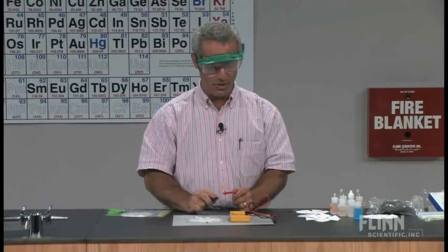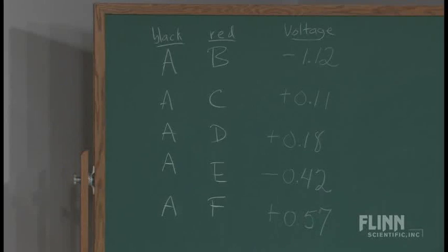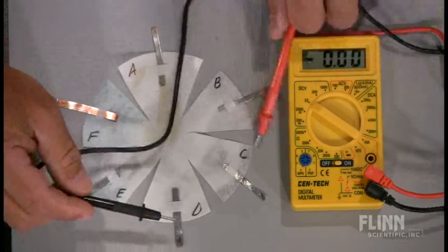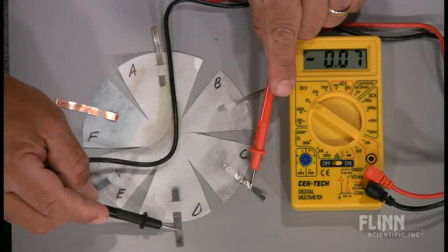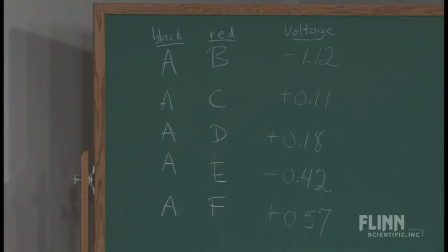We'll stop with that. But which two, just to see, which two are the closest in terms of their thing? I think that would be C and D. So we'd expect, if I hook these up to C and D, if I can get a reading here, a very small voltage between these two, only, there it is, negative 0.07, which is exactly how far apart they are there. It's nice, because it confirms it in a lot of different ways.